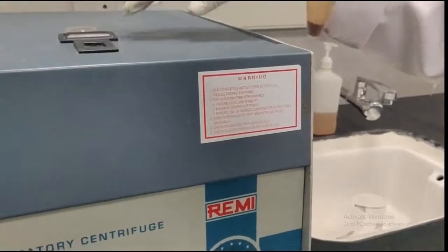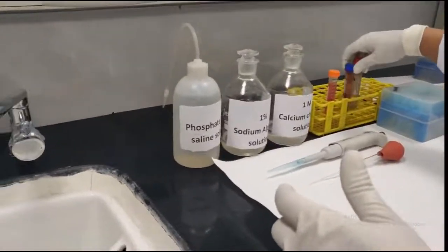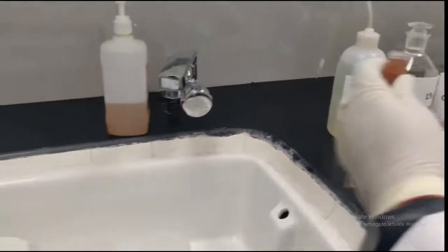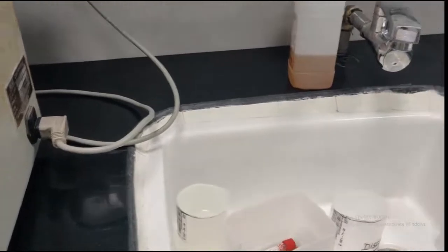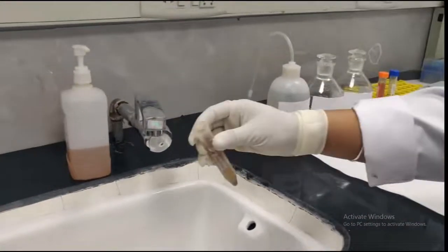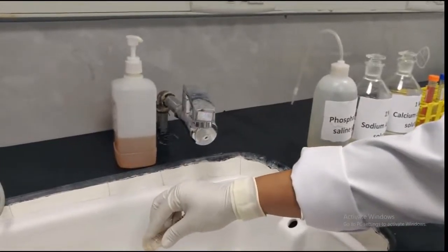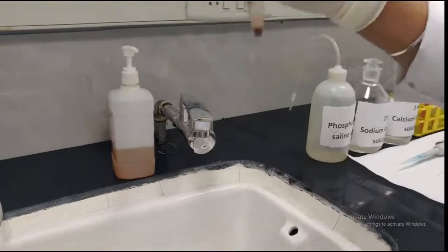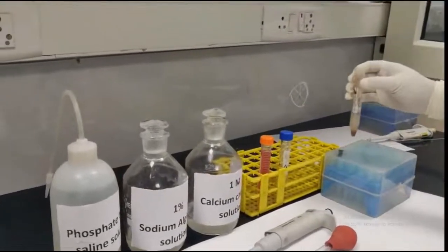So now we will discard the supernatant. Gently we will discard the supernatant from each of these tubes. So now, as in the thrombin clot method, we will give one step of washing.